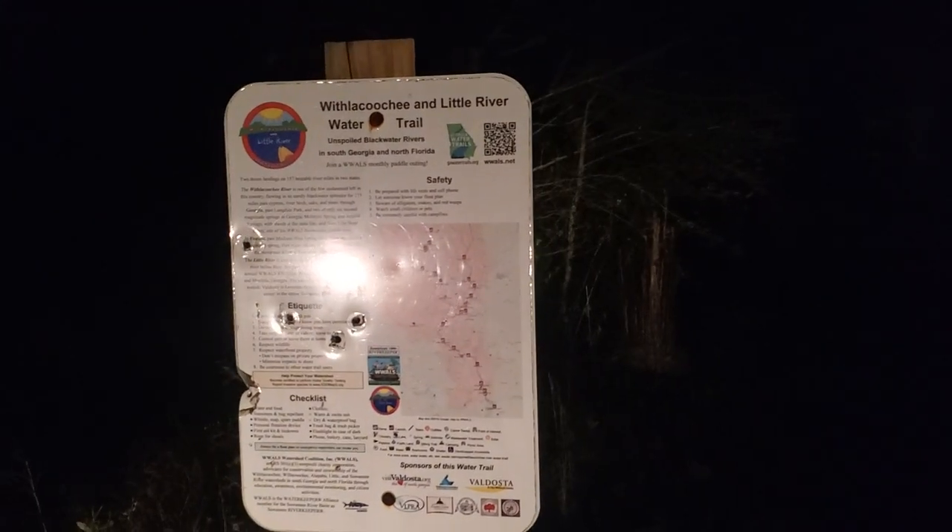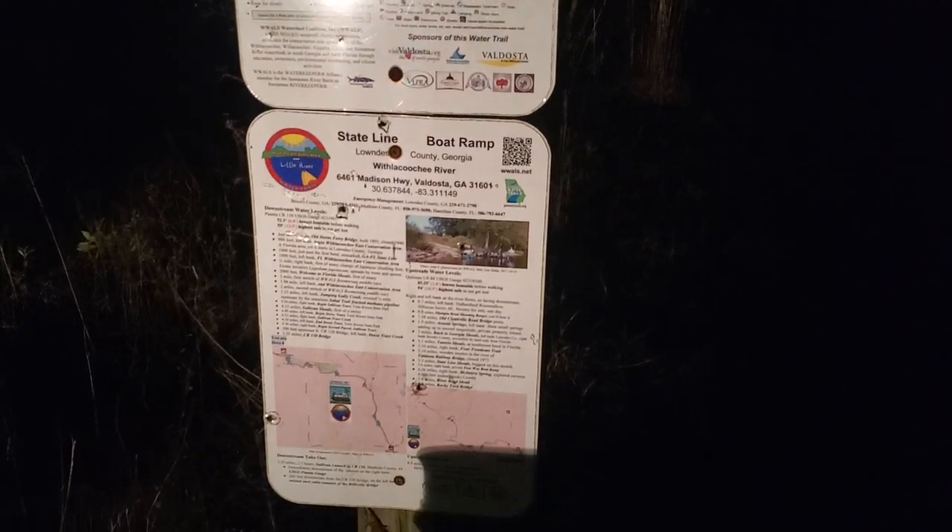State line boat ramp. I'm the Riverkeeper — this is actually the third stop. I started at Sullivan Launch, just across the state line in Florida, then state line, then Clyattville-Nankin boat ramp, where you can see the water is really moving here. These are all on the Withlacoochee River, so I'm going to get a sample here and then move on to the next one.